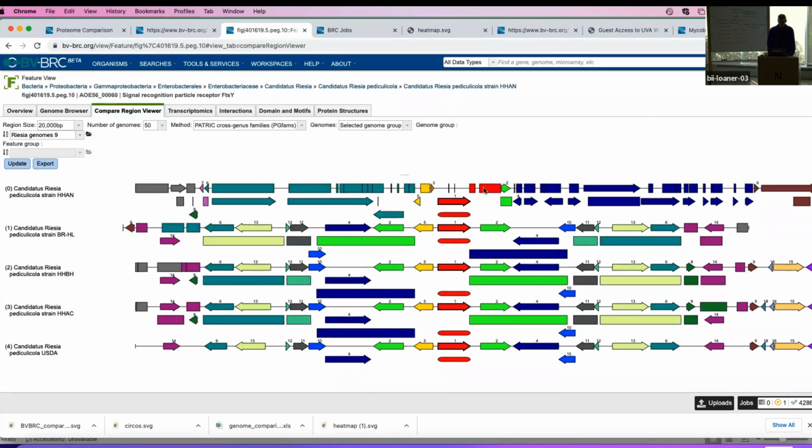That's something that you may run into, and it's just sort of interesting. You can click around and see what we've got in the set of genomes to get just a feel for what these look like. And again, I clicked on this one. I only have 5 hits here instead of the 9 or 10 that were in the set.